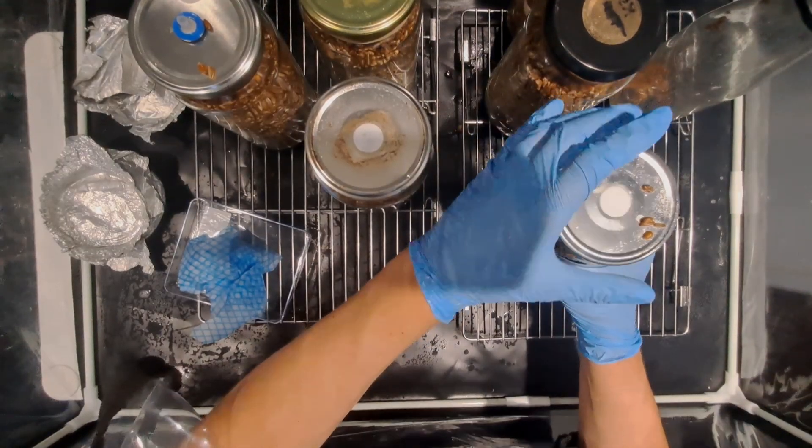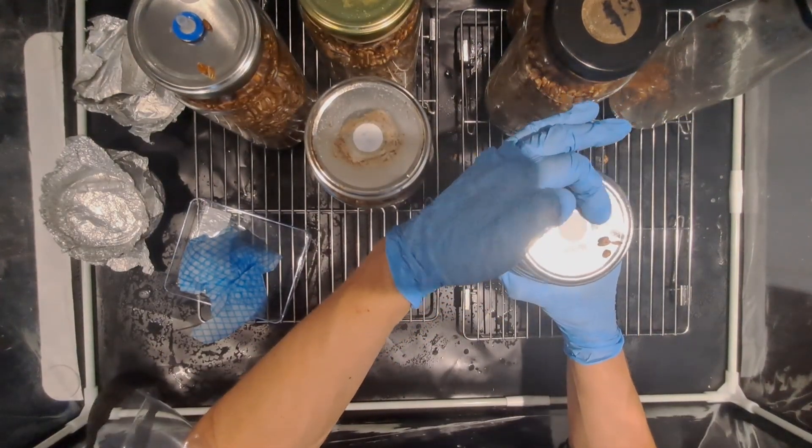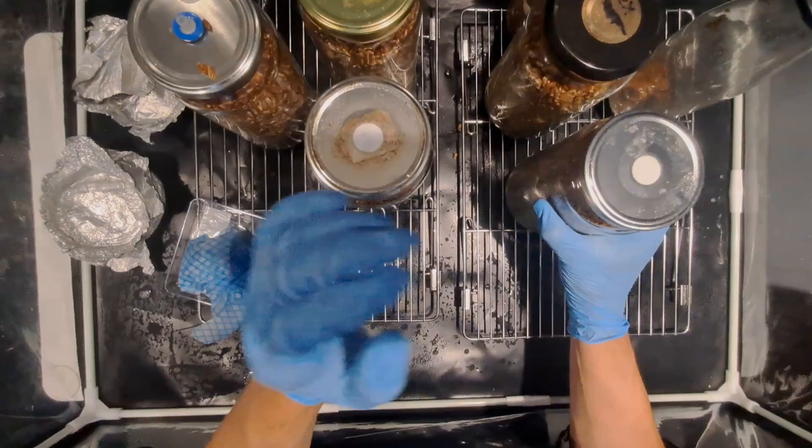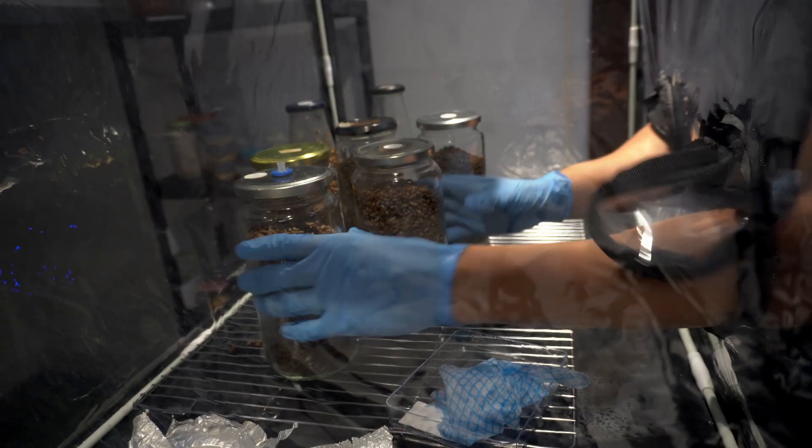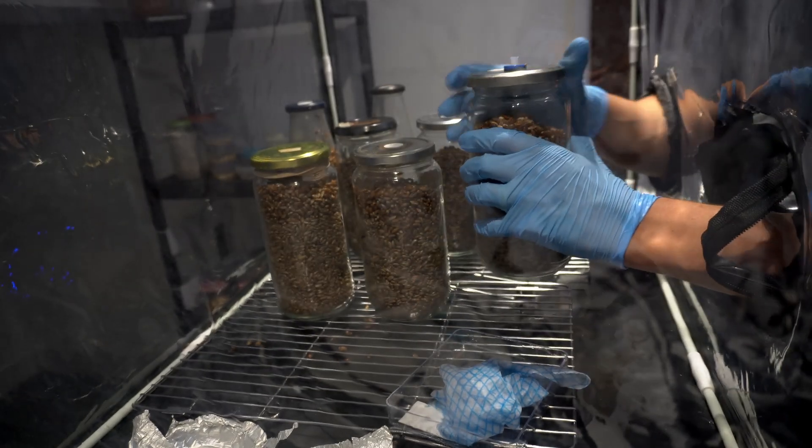Finally remove any stray grains from the top of the jars, tighten your jars up and you are finished. Leave them to incubate and you'll have plenty of spawn jars in about 7 to 10 days.